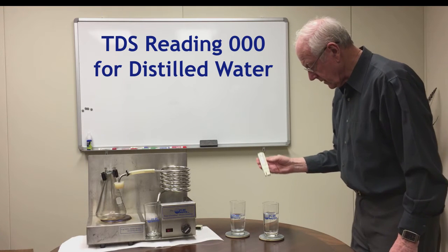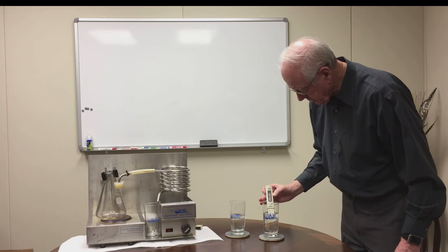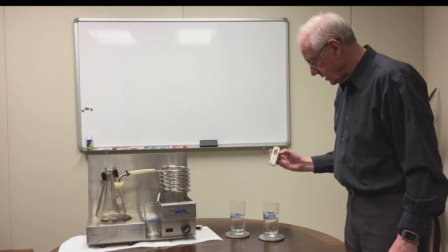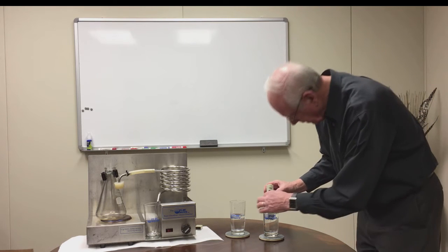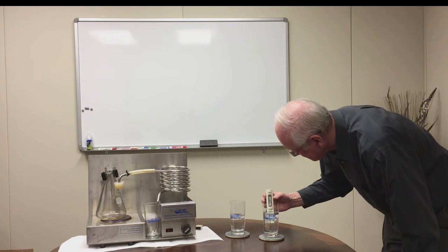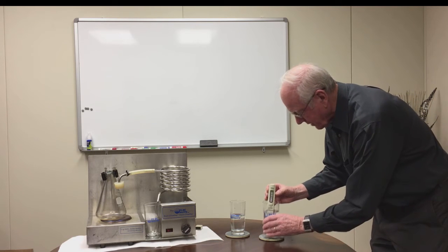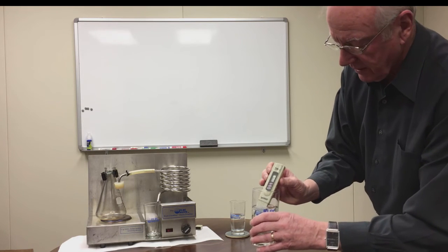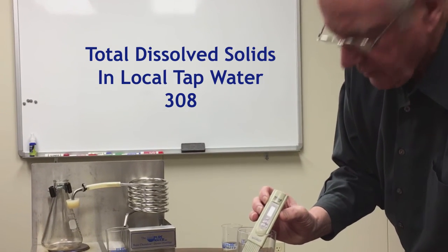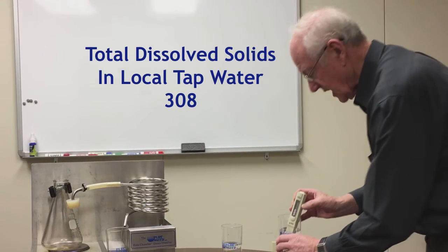Now I take the same TDS meter and put it into this water — this is water out of a tap here at the company. And it is reading — well, you can't read it when I take it out — but it is reading 309 or 308. It was 310 before. But this is tap water.